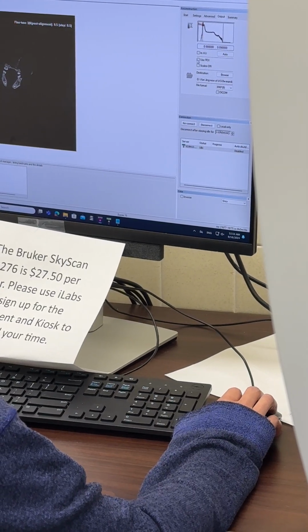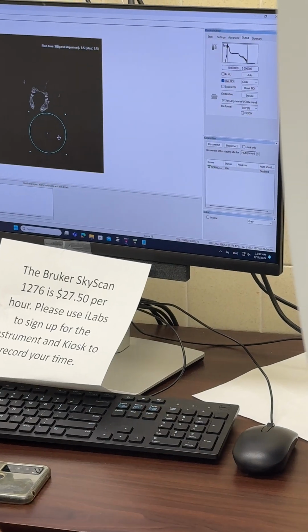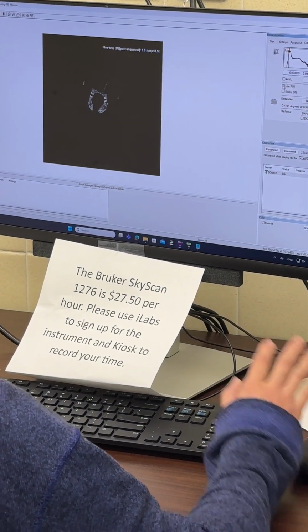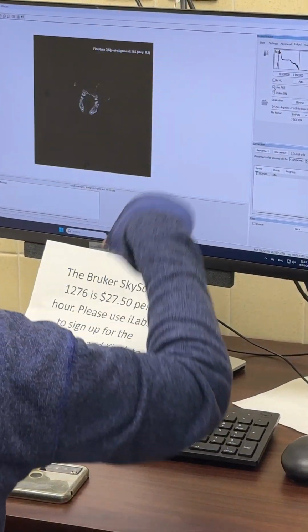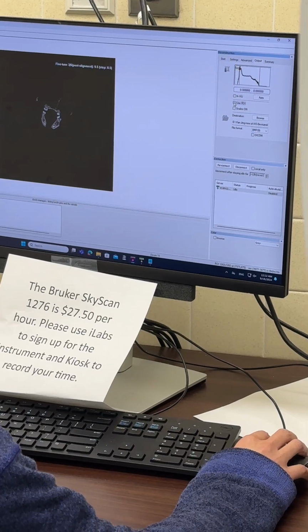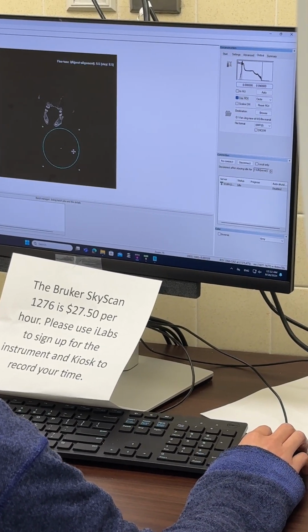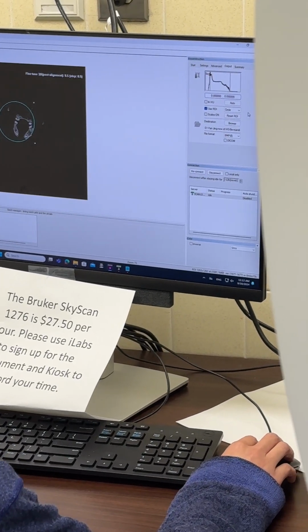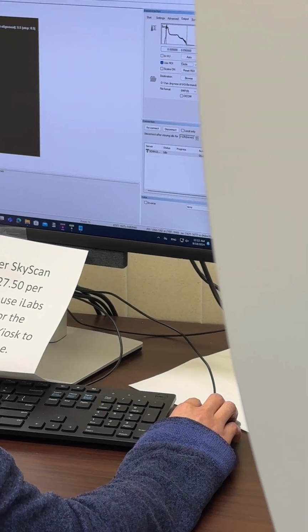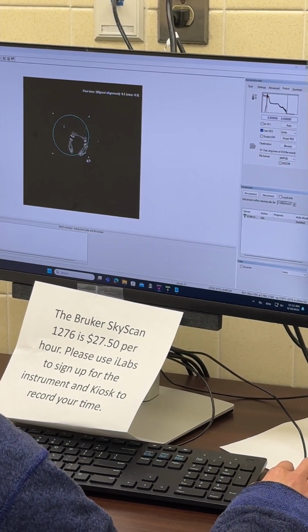And then what else? Use ROI. I recommend you guys use this one. It will make our data a little bit smaller. If we don't have those ROI frames, then it will reconstruct the whole thing, including a lot of empty space. It will occupy the hard drive space and also increase the work for the software. So use this one. And then there are some options: circle, rectangle, whatever. Yeah. And then left click here, then you can zoom in and out. And use this one, you can move the ROI.